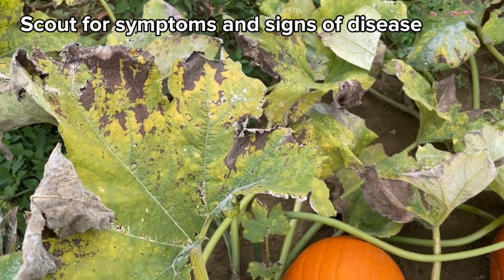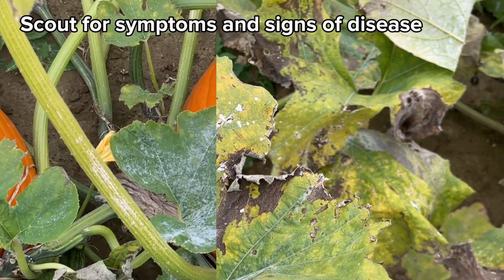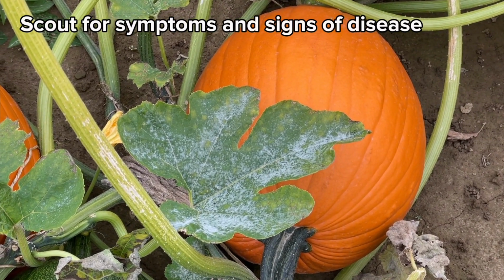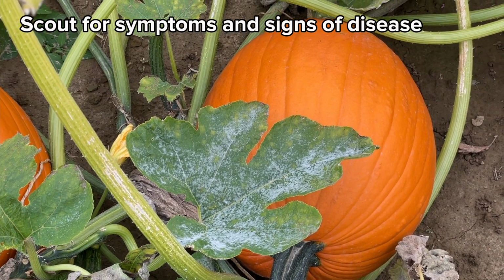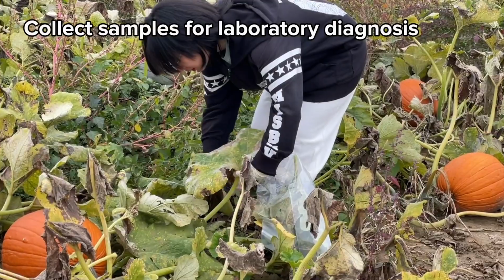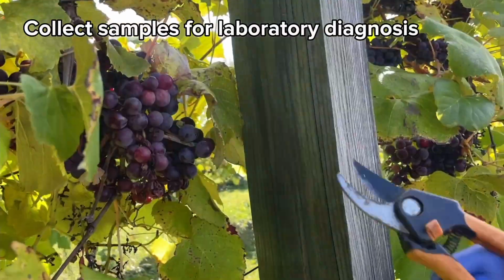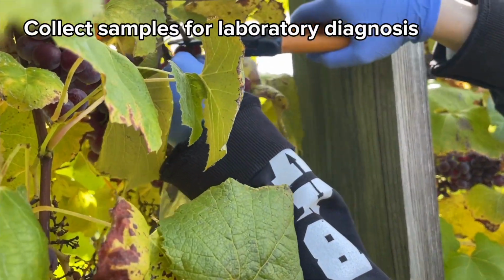Symptoms are the abnormal reactions of plants to plant pathogens, while signs are the plant pathogens themselves, such as the white fungal growth seen on these pumpkin leaves. If you find significant symptoms or signs, collect the samples using pruning scissors or trowels, depending on the samples.